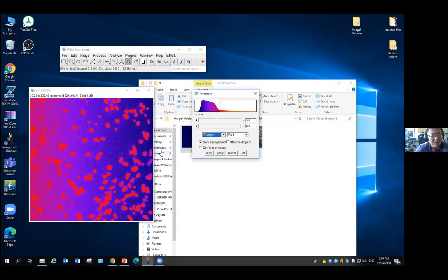This is what we call local thresholding, also named adaptive thresholding. In this case, you need to design an algorithm that includes a calculation over the neighboring pixels of each single pixel. So for every single pixel, it calculates a different thresholding value depending on its neighbors. So it will compensate for those uneven background issues.